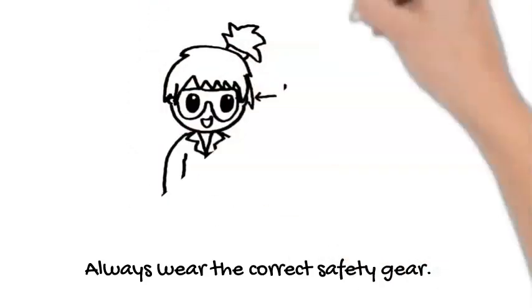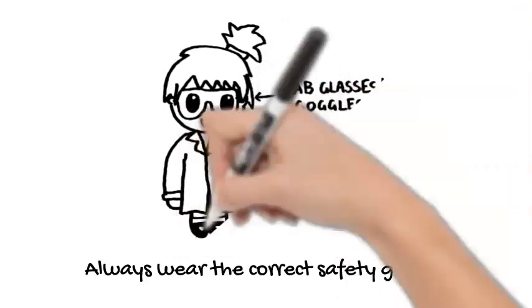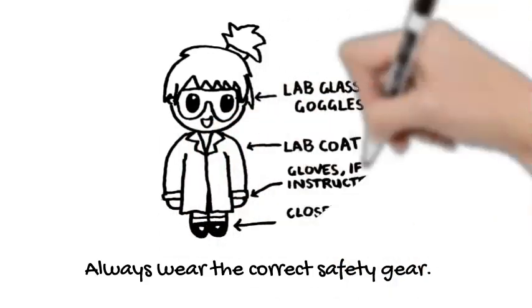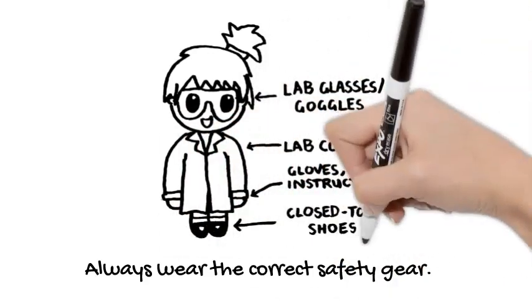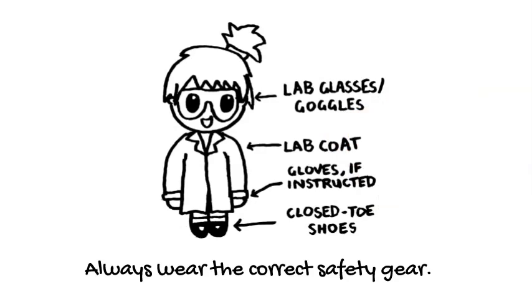This includes your safety glasses or lab goggles, your lab coat, gloves, but only when your teacher tells you to because some glove types are flammable near a Bunsen burner, and of course, closed-toe shoes.